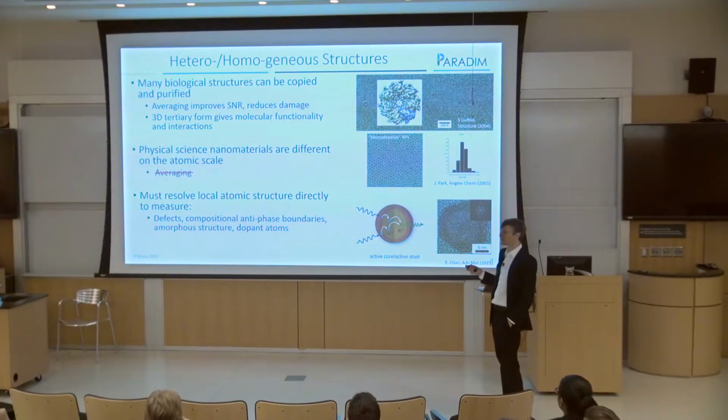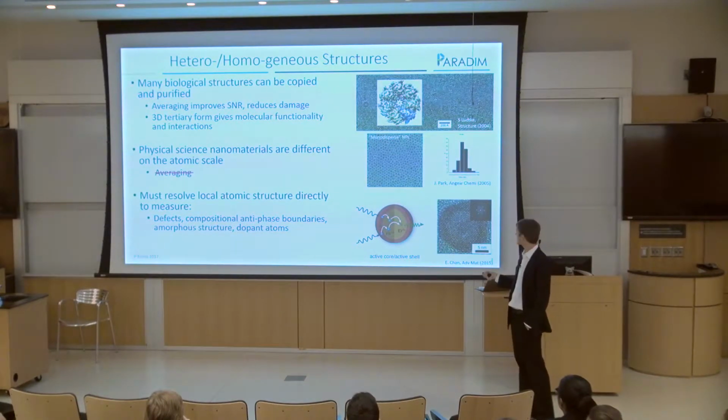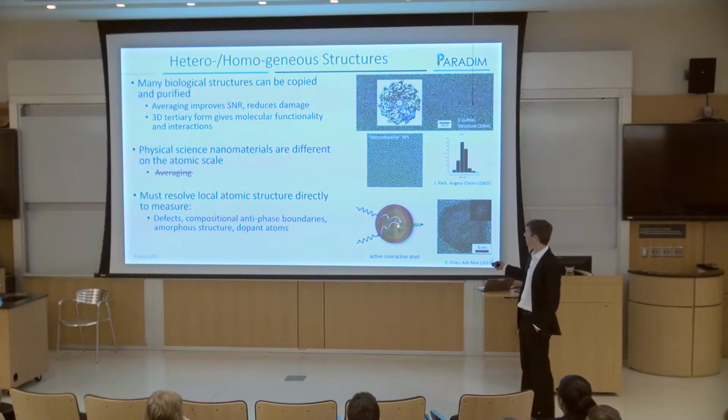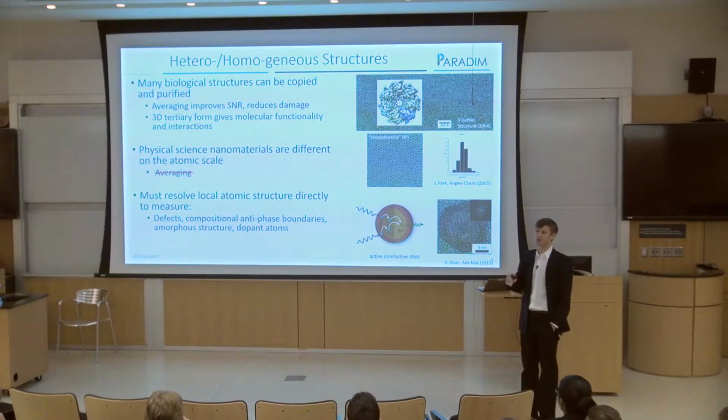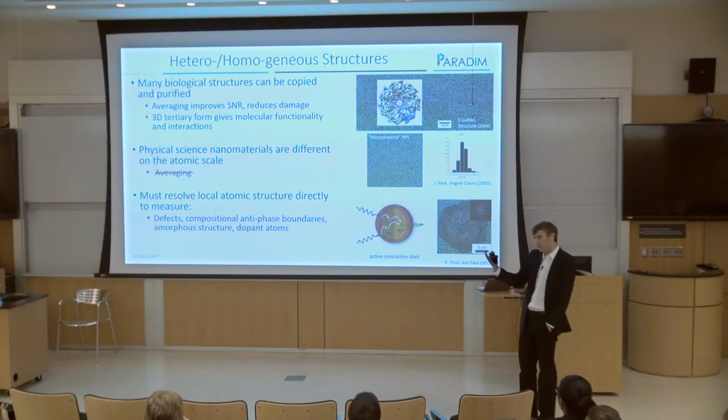And what's becoming important in almost every level of how things are functioning, like your computer, for instance, is where a couple of atoms are in the source or the drain or the gate of a transistor, or even in these nanoparticles, like active core-shell nanoparticles, where single atoms are in these objects is important. Whether they're in the center, dispersed, or clustered, that's very, very important. So getting two-dimensional images like this is very, very useful, but it's not the end game. It's not what you really want.